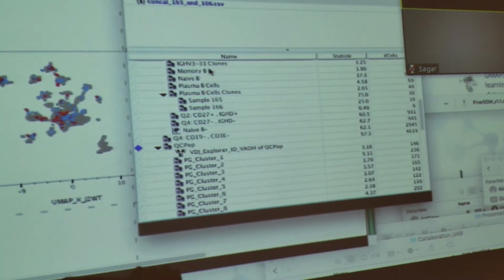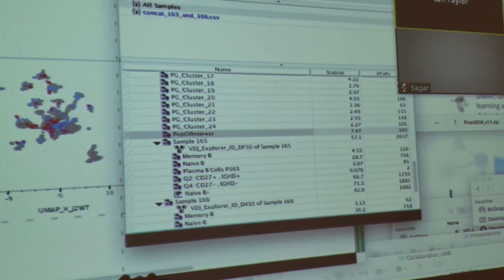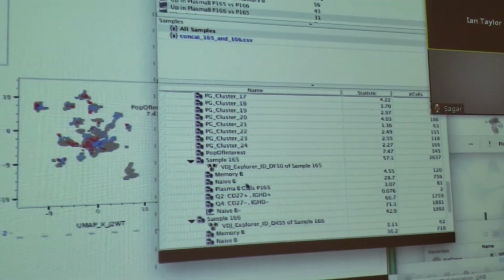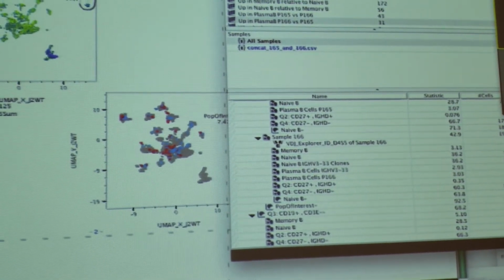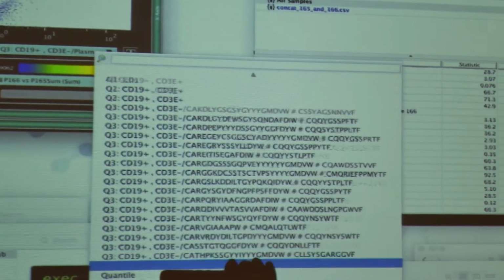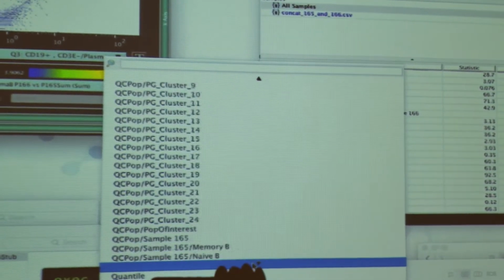Yeah, so usually that would mean doing some kind of differential expression analysis, and we need something to compare with, which could be everything else. Right. That would be okay. Always kind of my default is to look at that versus everything else. So that's going to take us back to a volcano plot. So I want to find everything that's not in the pop of interest.